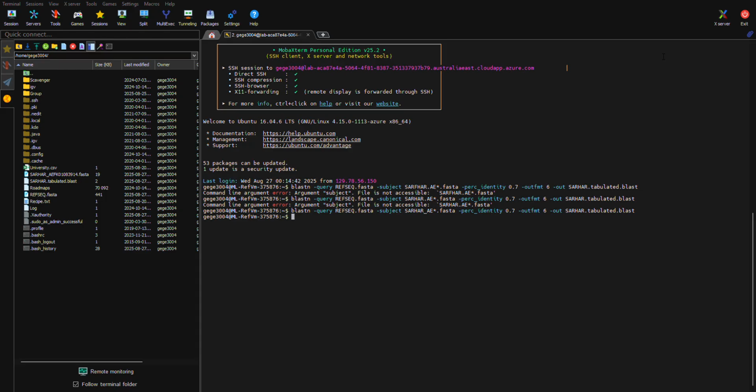And what's the -g mean? Numeric sort, and the -k, column, right? So we're saying take the output that you just created, sort it based on column 12, and then, still don't print to the screen yet, pipe that into the last command, which is what? The tail, the last 10 lines. So if you sorted it numerically, what's going to be the last line of the file? The biggest number, which is what you're interested in.